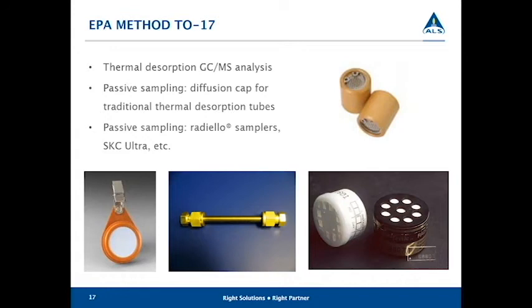At our Cincinnati laboratory, we don't have any experience with ordering those for clients. I don't know if Nicole has anything that she could contribute on that. No, I think that the flow controllers and critical orifices that we provide at our location and across the network, they do typically have particulate filters, but I'm not aware of there being moisture filters at this time.